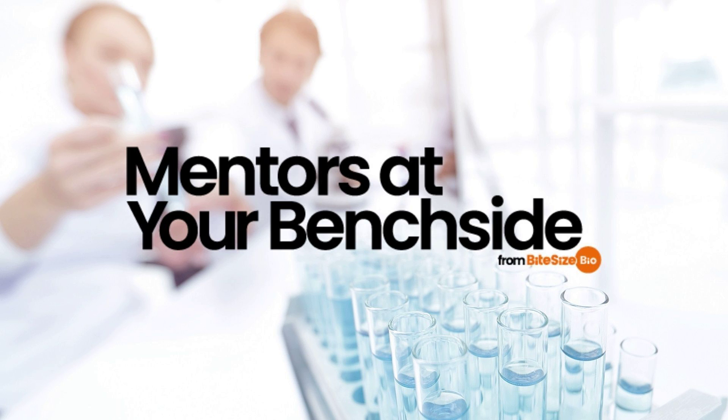I'm Laura Grassi, and today I'll be talking to you about how phenol extraction of DNA works. Phenol extraction of DNA is a commonly used method for removing proteins from nucleic acids. That is, remove proteins from cell lysates during genomic DNA preparation. It's commonly used, but not well understood. If you want to know how phenol extraction works, listen on.